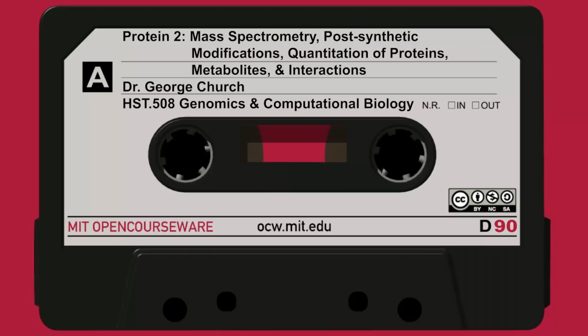For the Y series, which is in blue here, and tends to be the higher peaks, and the B series in red, which tends to be slightly lower peaks. And then you've got these little arrows. The darker arrows indicate the Y-ion series that separate two adjacent peaks, because the difference between those two peaks is the addition of one amino acid.